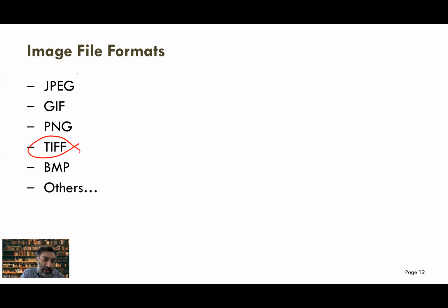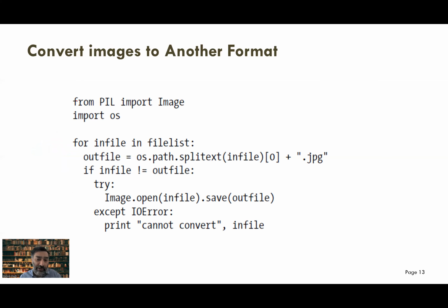Whereas the JPEG, GIF and PNG are compressed formats and they lose quality. In research, we also have many other types of file formats, and many are proprietary, but usually all the proprietary formats convert files finally into TIFF format, and TIFF is the best to do final image processing, but only for the final image processing.